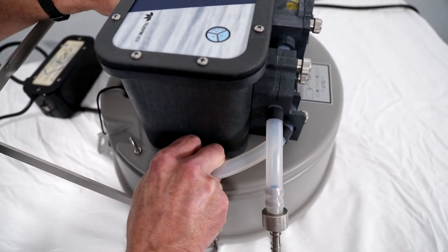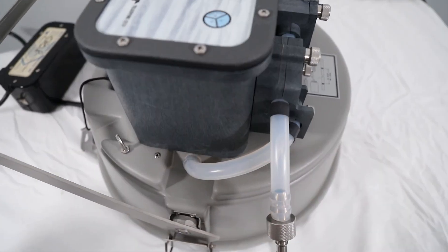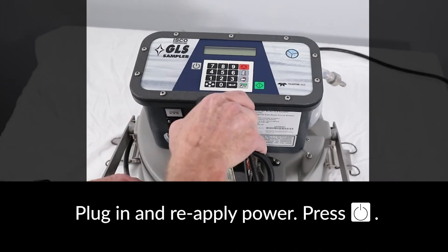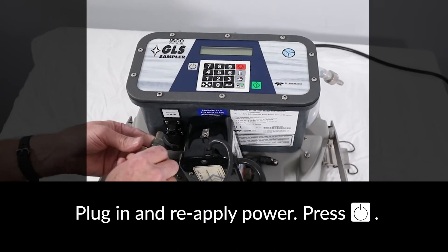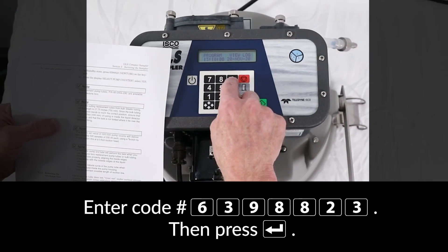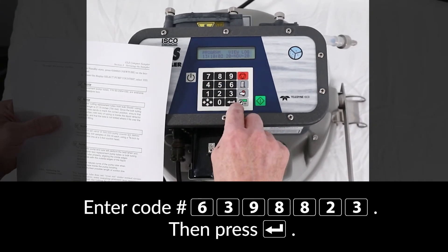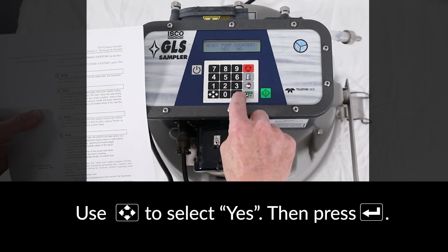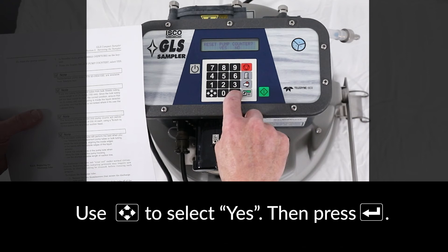Connect the discharge side of the pump tubing to the bulkhead fitting on the GLS center section. Reapply power to the GLS. Enter in the code 6398823 from the GLS user manual and press Enter. Reset the pump counter by selecting Yes, then press Enter.